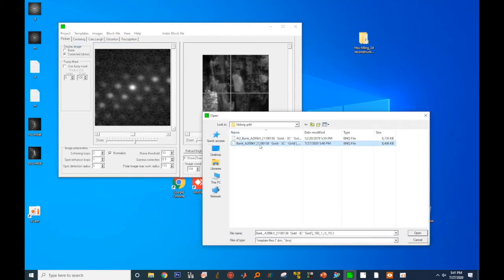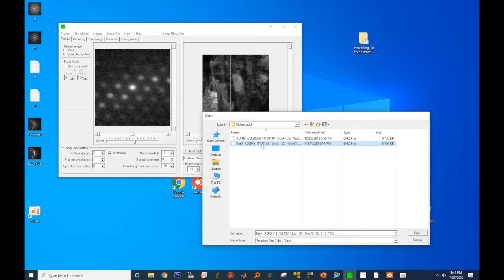Select the bank file which is created for gold. And you see the third viewing window. In the third viewing window, the black spots are from the experimentally acquired diffraction pattern, and the red circles are from the simulated templates. With the current setting, it seems to be a fairly good match.